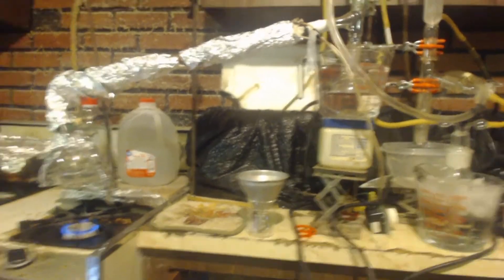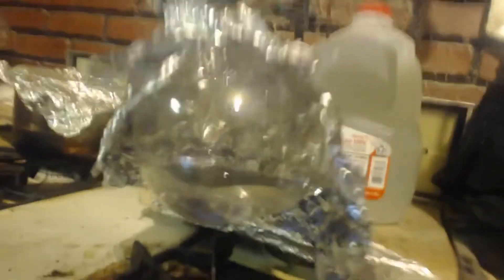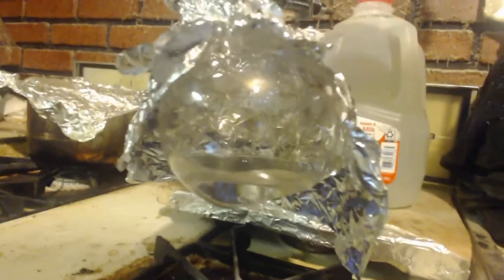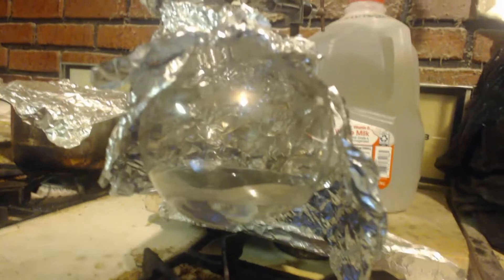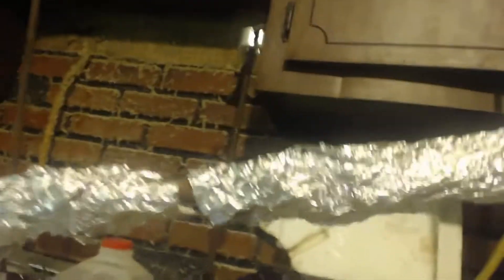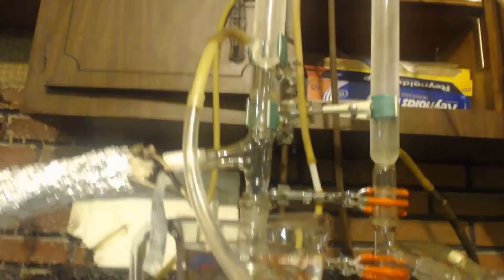Here's my setup. You can see it's set up like a distillation. I got the ethanol in there — I'm using 95%, or whatever the azeotrope is. Obviously, if you use pure ethanol, you'd probably get a better yield. And it goes up just like a distillation. There's my copper, getting heated by the heat tape.